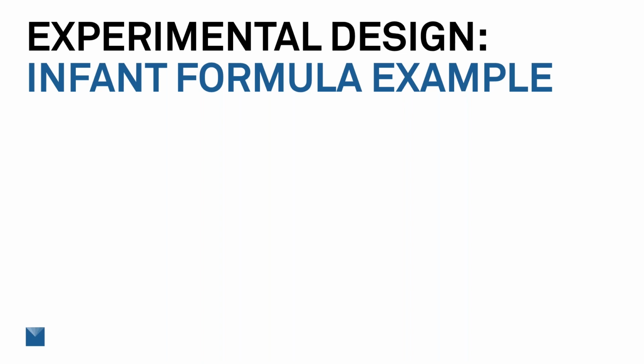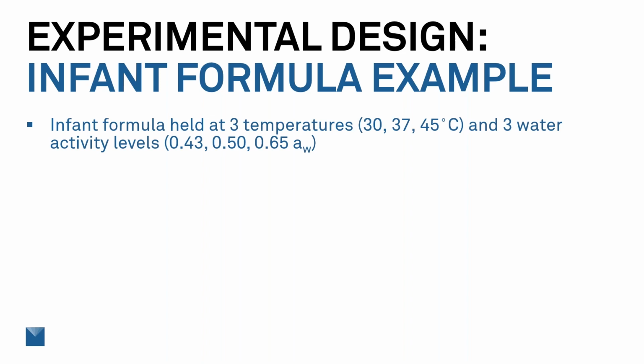So to explain it a little bit more as an example, I'm going to talk about one that we have done a few years ago, infant formula, and how we set it up and how we went through it. It is actually a fairly complicated process. There are lots of books and articles about accelerated shelf life testing. And as a matter of fact, this example I'm going to be talking about was published and can be found in the Shelf Life International Meeting of 2017 in their proceedings. And we'd be happy to give a copy of that if you'd like to know more. But I'll go through it just a little briefly so you get kind of an idea of what's involved.